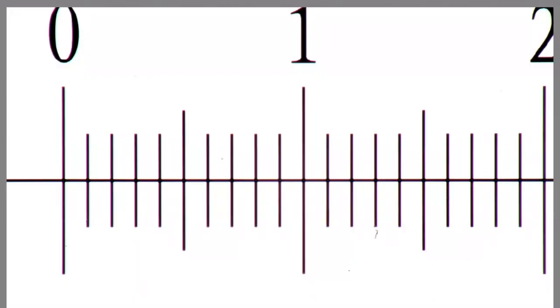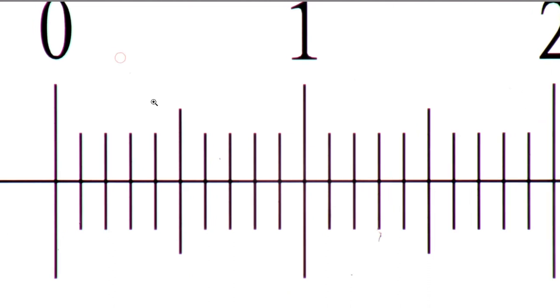Well, I'm now in Photoshop. I imported the picture and I'm zooming in a little bit right now. So I'm not making it larger, but I'm just zooming in. So I'm not changing the pixels, of course. Now we see also some chromatic aberration, the purple edge. I'm always taking the left edge of the line and I'm simply drawing a frame here to select it. And then I'm coloring the frame in simply using a paintbrush. That's pretty much it.